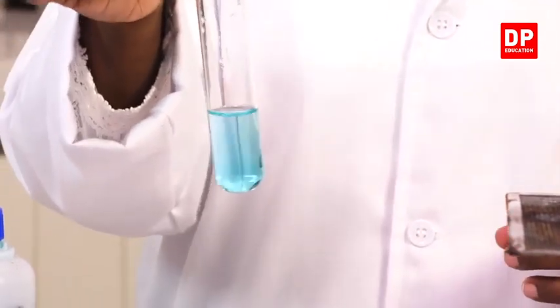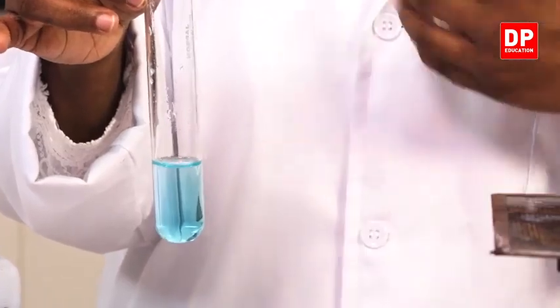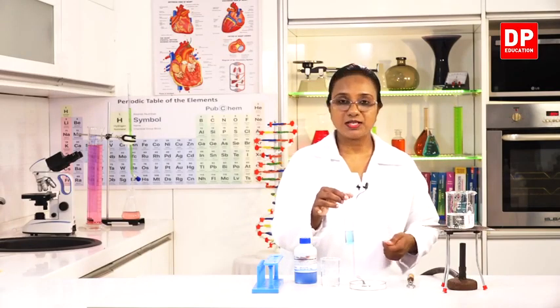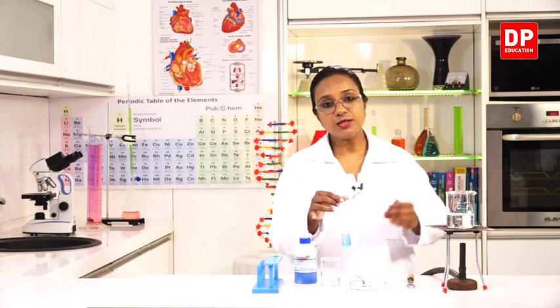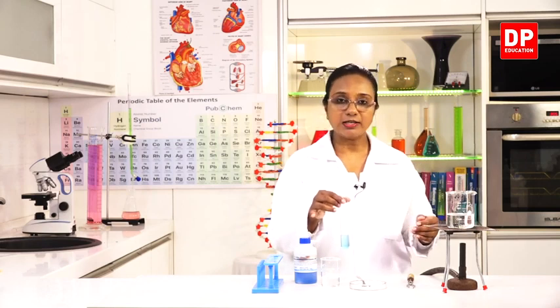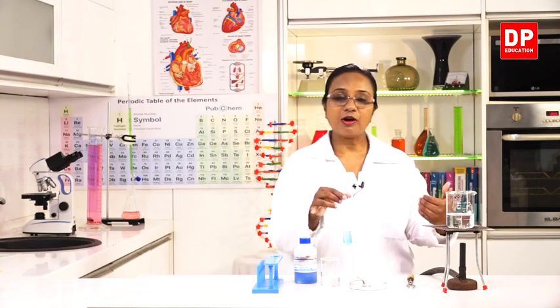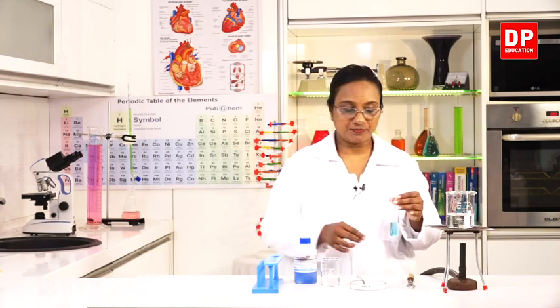We can directly heat this solution in the flame, but that will give rise to a very fast color change and you will not be able to observe it clearly. In order to avoid that, we use a water bath. A water bath is a beaker containing water and we heat the water. So gradually the heat from water will be transferred to the solution mixture.